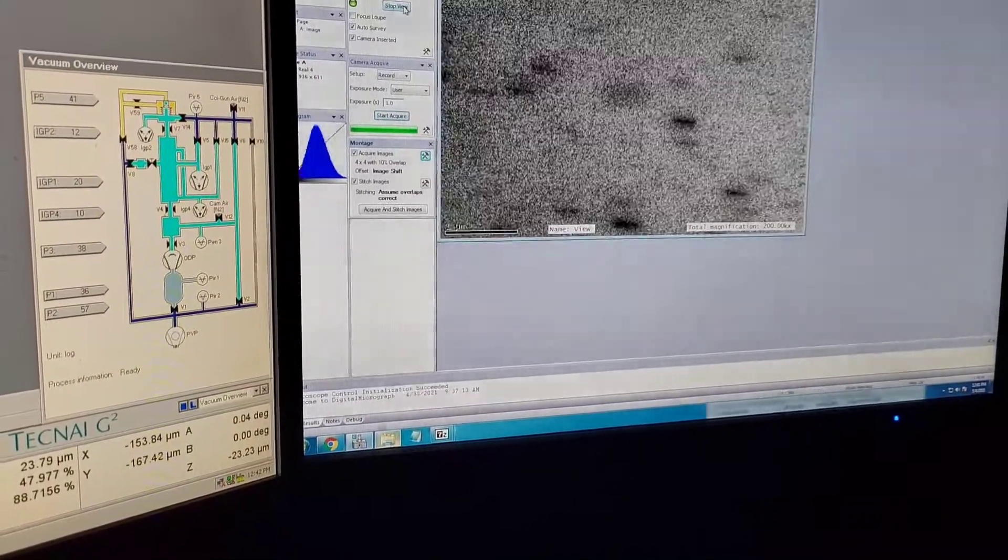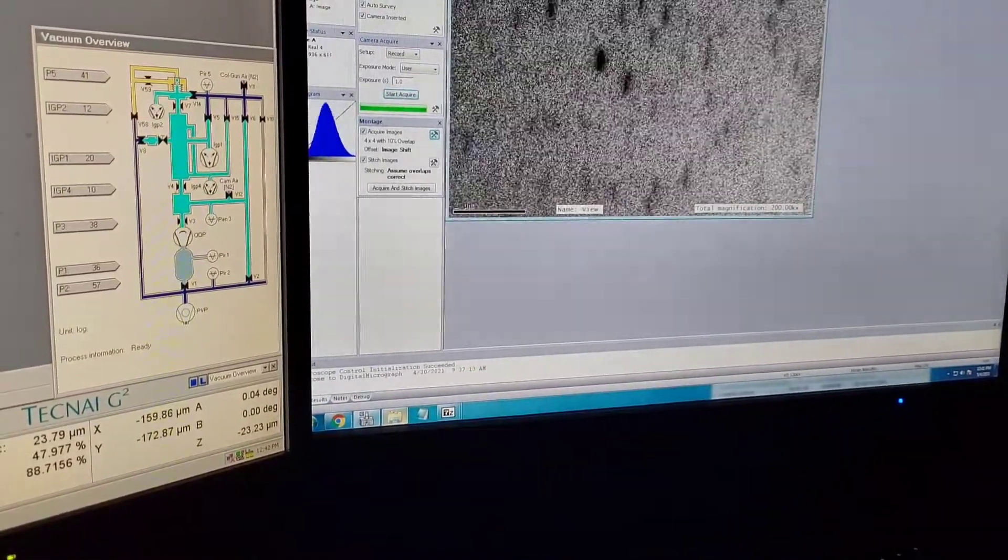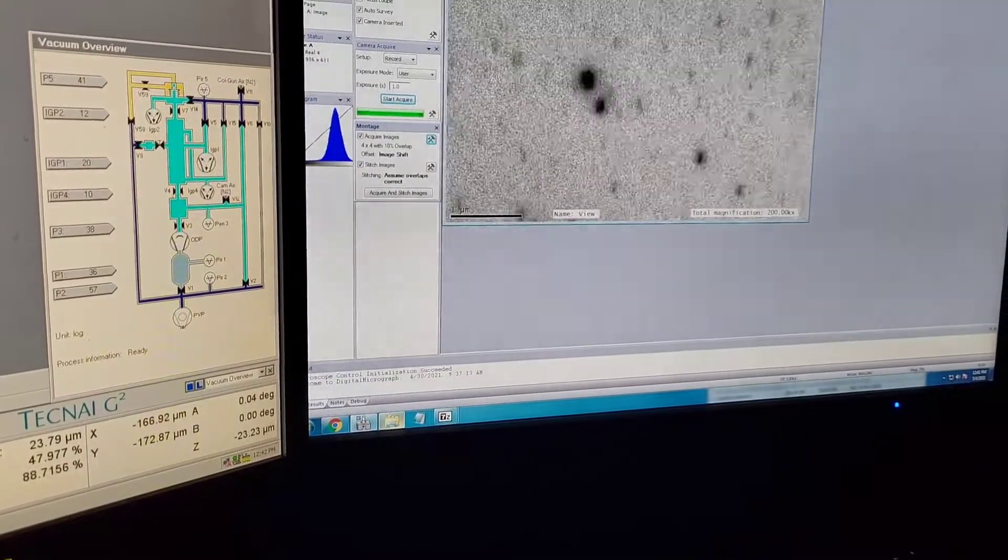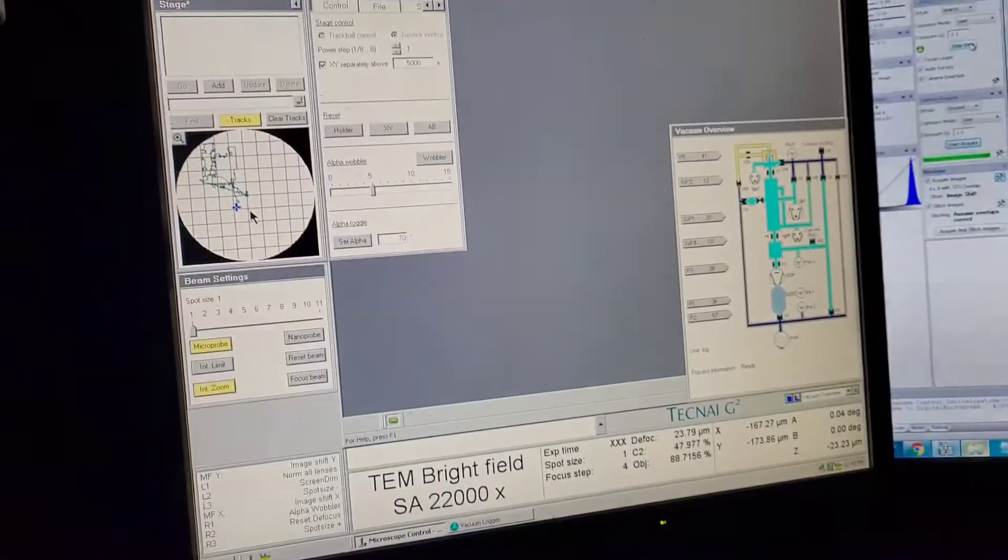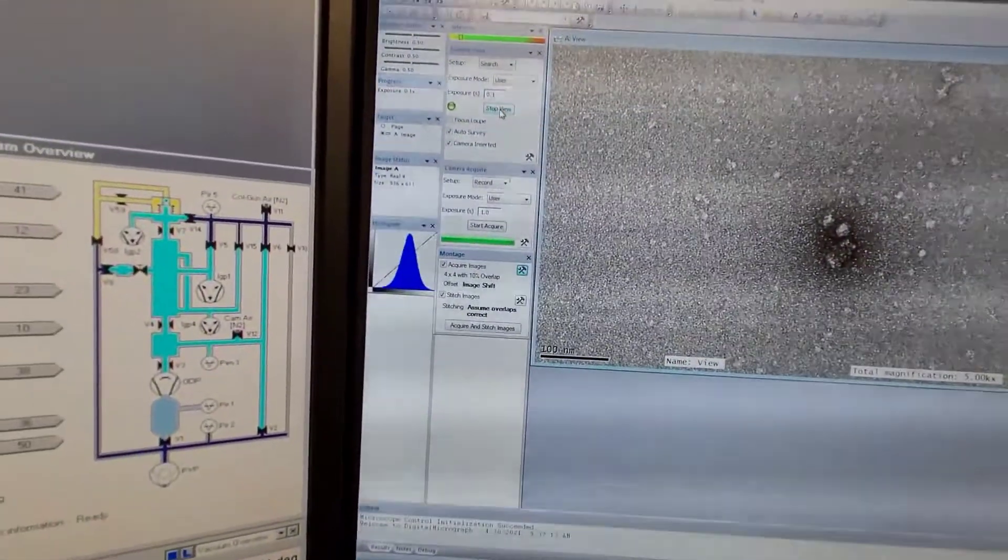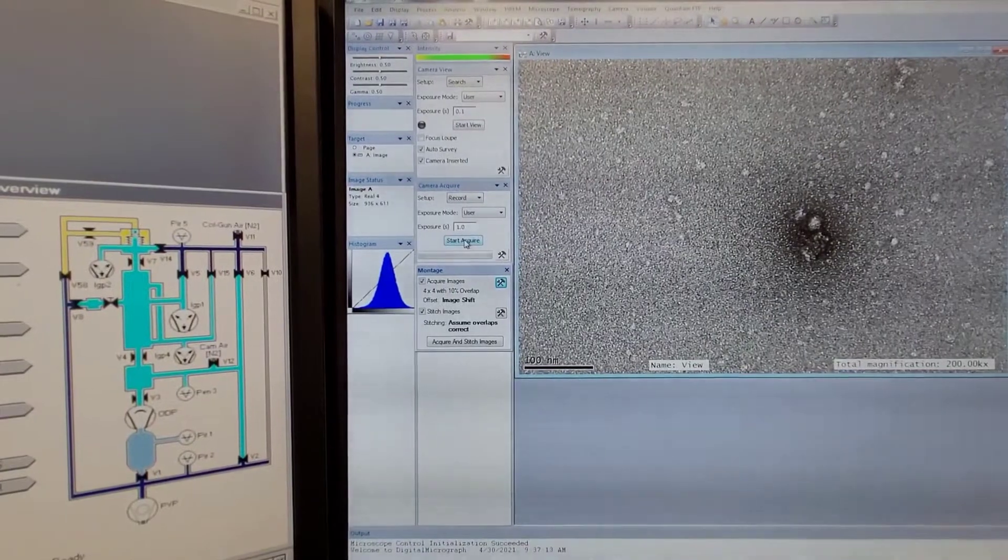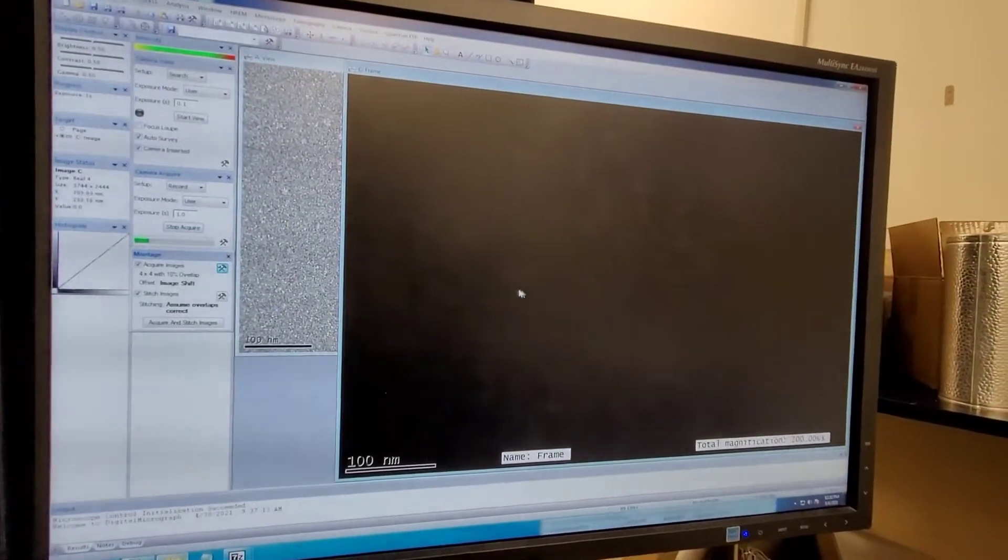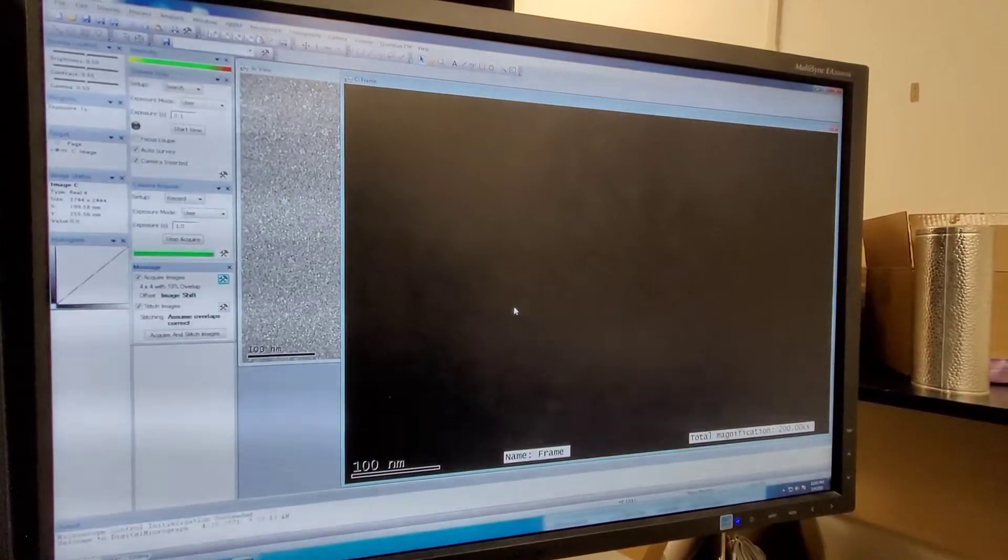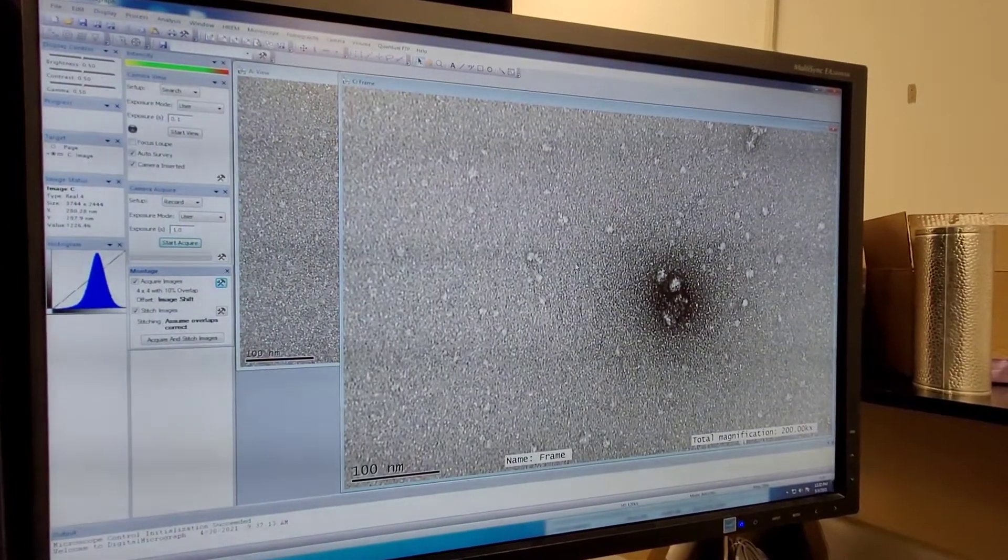The focus might change a little bit depending on the magnification you have and where in the grid you are, so you might have to adjust that. To take an image, you stop the view, start acquiring an image, and then you wait for it to acquire. Then you see if it's a good image.